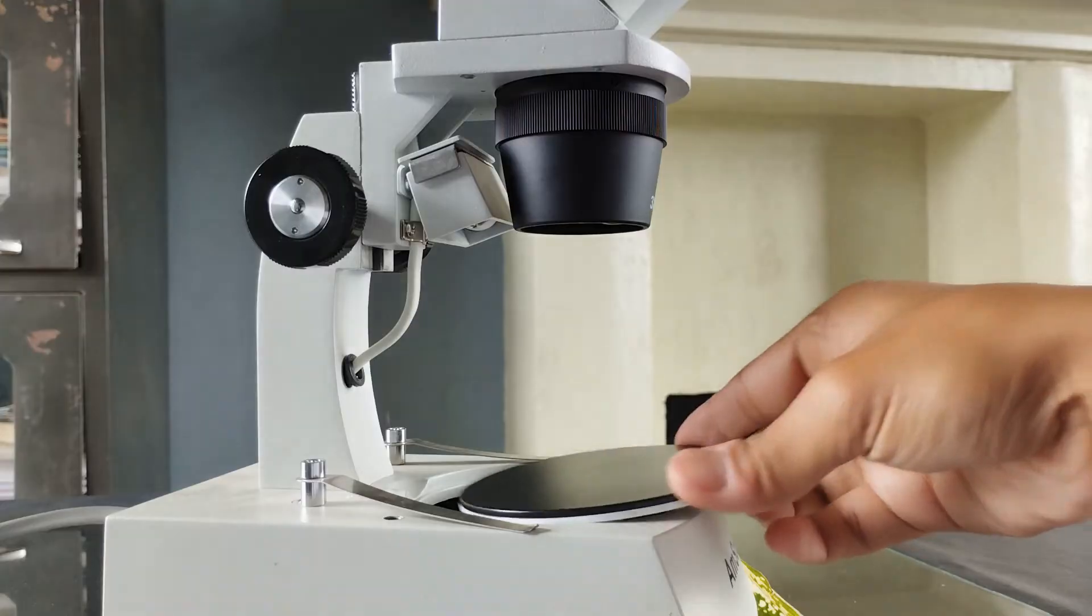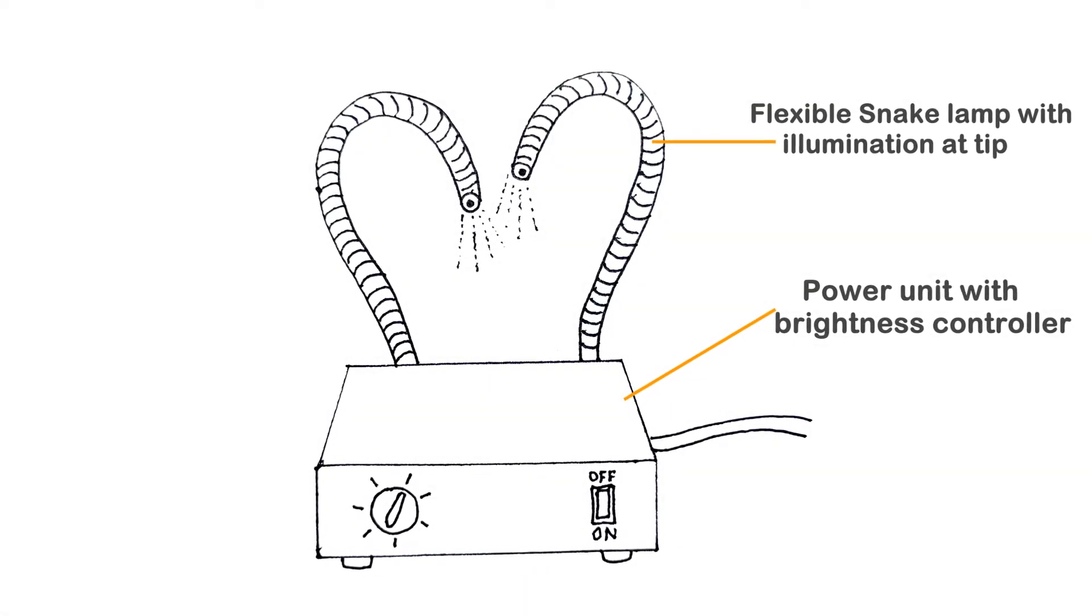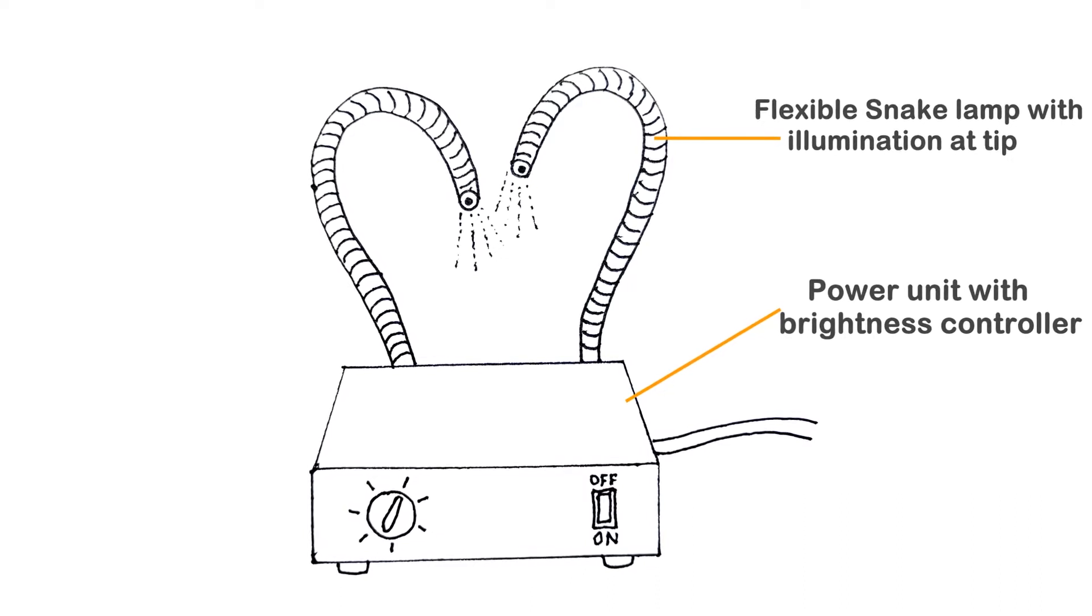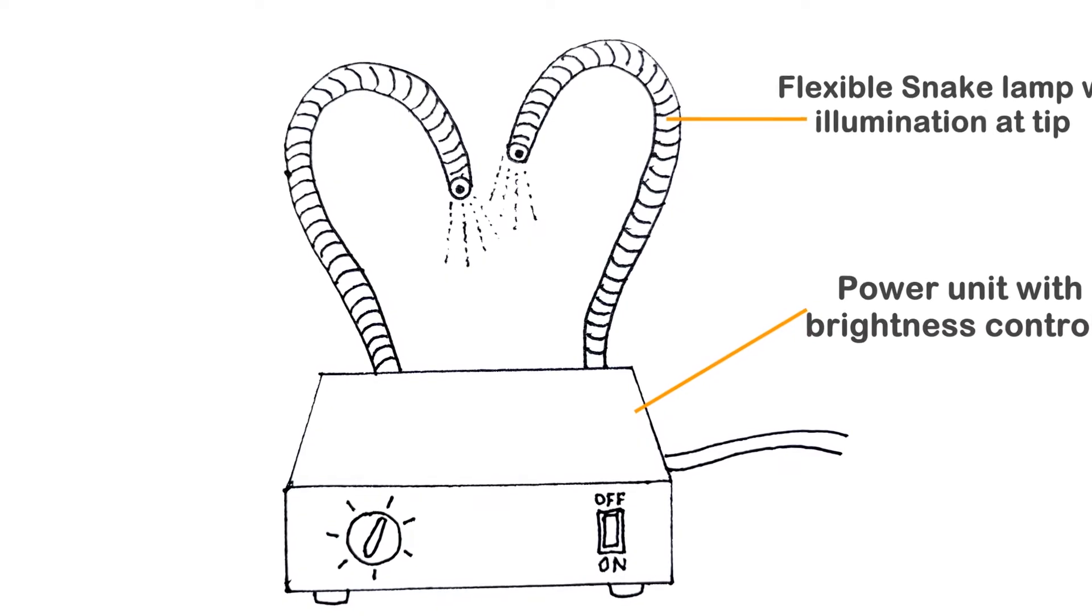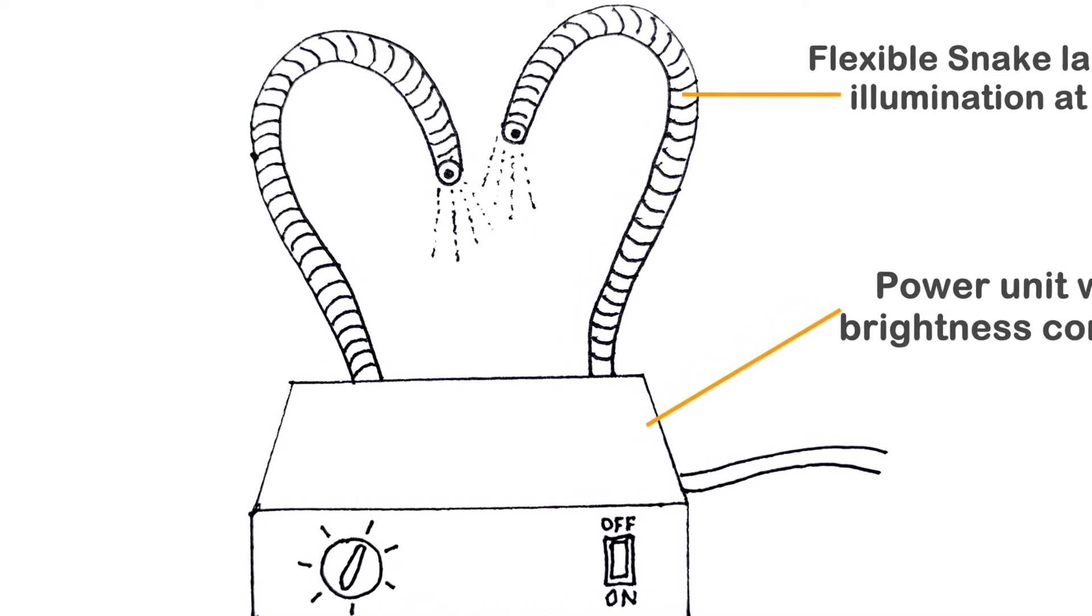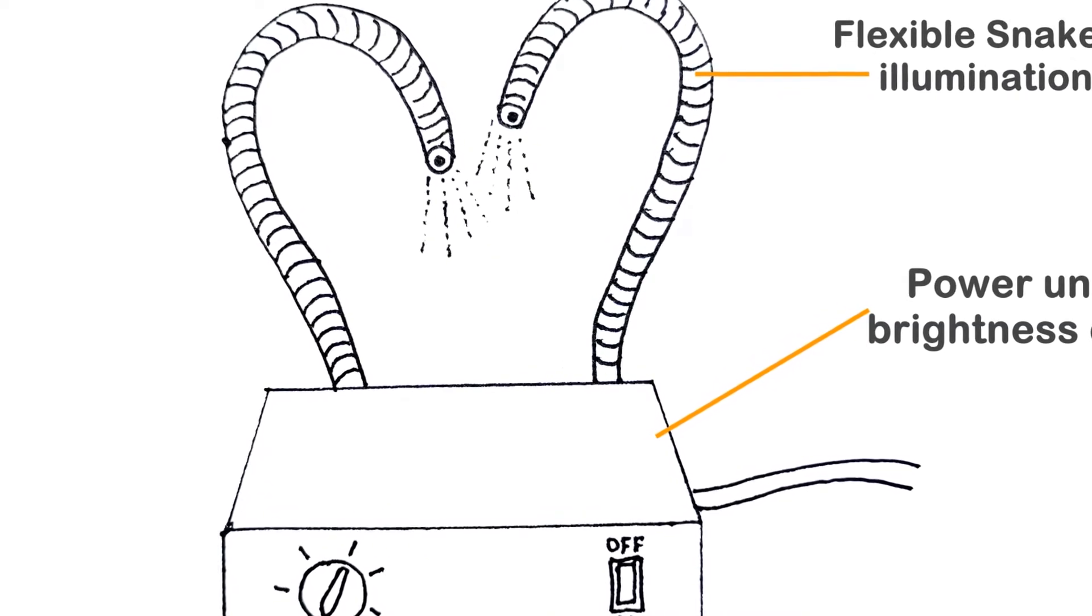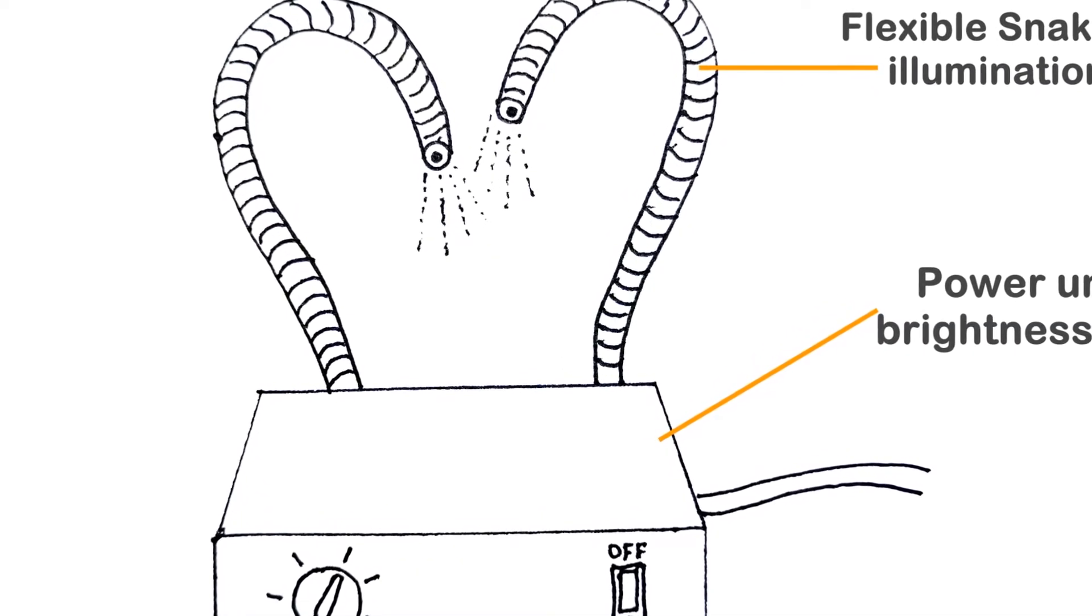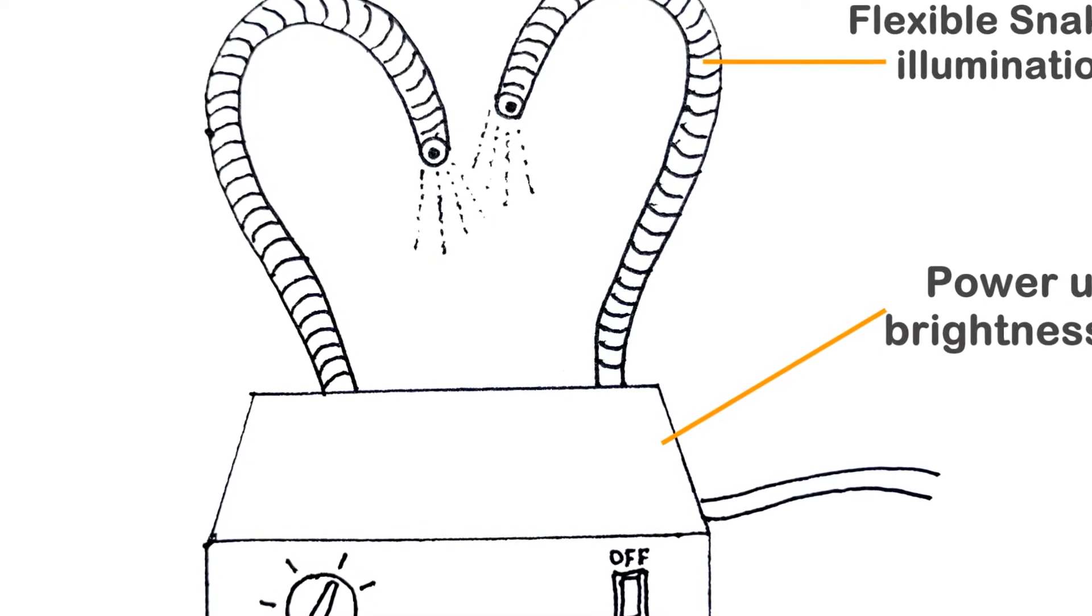Depending on the level of complexity and sophistication of the stereo microscope, the top light source may come as a separate unit powered externally and consisting of flexible, adjustable snake tubes with the light source located at the very end of the tubes and whose brightness and intensity can be adjusted as per one's requirement like you see here. Nevertheless, the basic function of the top lighting system is the same and is projected towards the specimen surface.